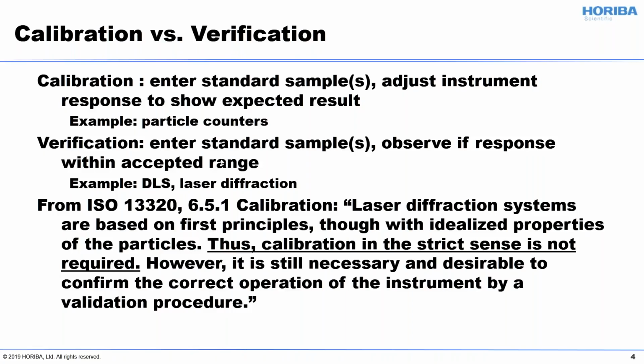This comes down to the geometry in the instrument and the wavelength of light you use is pretty well fixed. It's not going to go anywhere. And if you put in a material with known particle size and you get the wrong answer, that means that either you have a procedure problem or your analyzer is broken. So this is what I mean by it being boring. If you get the right answer, you just move on your way and run your unknowns. And if you don't, it can get pretty exciting.